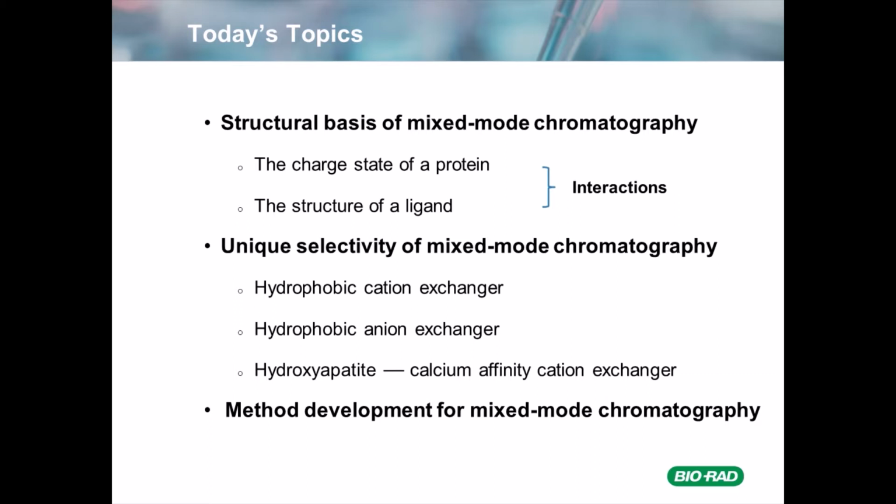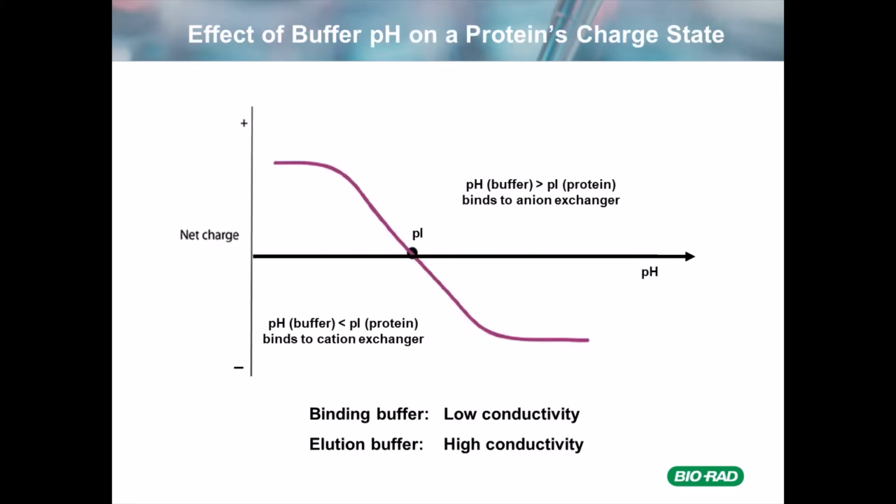And then I will show you some examples to showcase the unique selectivity of mixed-mode chromatography resins, such as hydrophobic cation exchanger, hydrophobic anion exchanger, and hydroxyapatite, which is a calcium affinity cation exchanger. I will also briefly touch on the method development for mixed-mode chromatography.